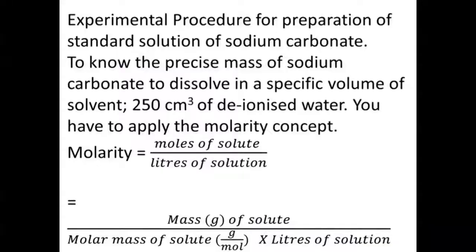Our experiment: we want to prepare a standard solution of 1 molar sodium carbonate. And to do this, we follow the following experimental procedure.